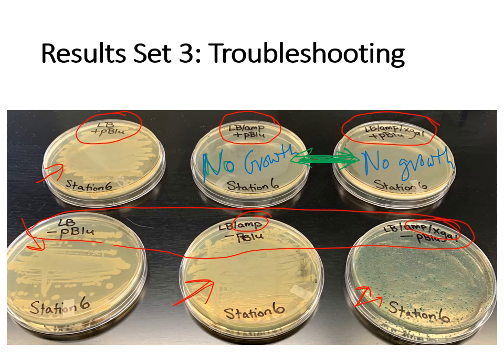The last thing I want to mention before letting you go in this video is when you look at each of these plates, you see that plastic outer rim. That is the cover of the plate, so they're currently flipped upside down in this picture.